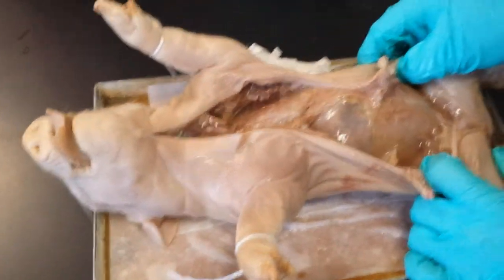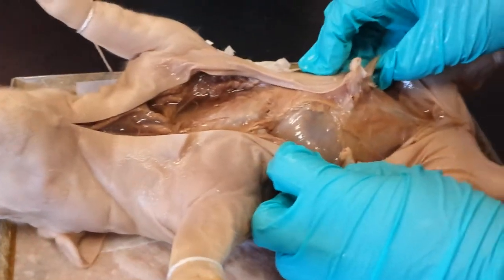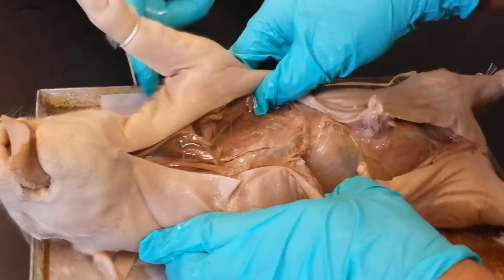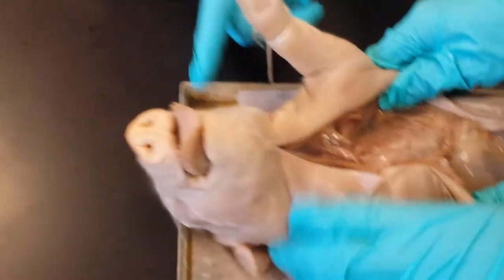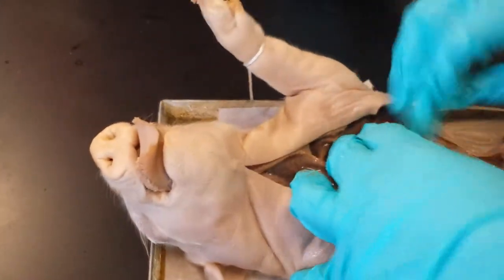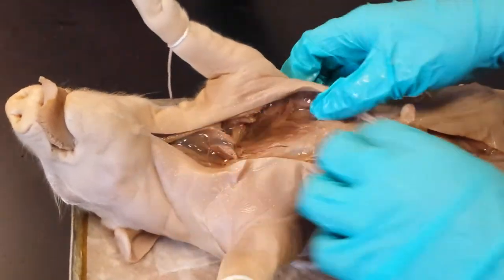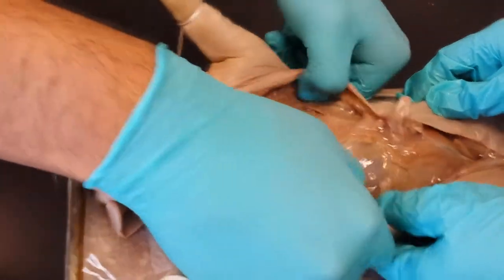I can see inside. Locate the large lobed reddish brown liver in the interior of the abdominal cavity. Anterior. The what? The liver. The liver, yeah. It's kind of gross because I didn't know what this was and I kept on touching it. I think it's a cork board. What did it start squirting? Might be. Can't find the liver, you guys. So it's large, lobed, and reddish brown. I feel like I probably should know.